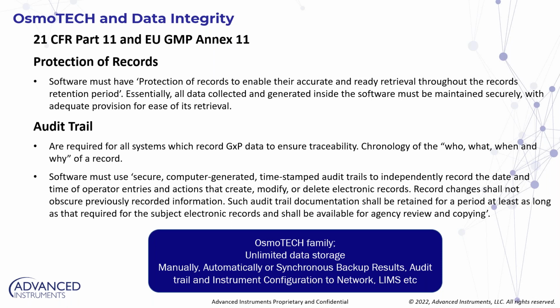Let's say I log into the instrument, I type in my user ID, my password. As soon as that activity happens, the audit trail will say Shweta, or my user ID, has logged in at this time, right? Now, if I make any change, let's say I change the logout time from 5 minutes to 10 minutes, when I go into the audit trail, it would say that the logout time was changed by Shweta at this time from 5 minutes to 10 minutes.